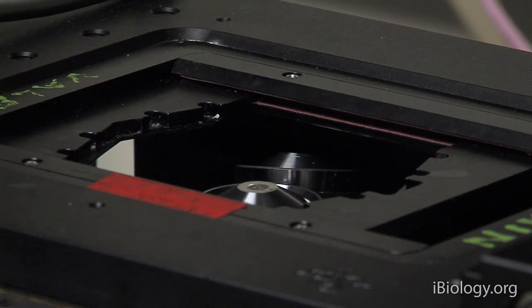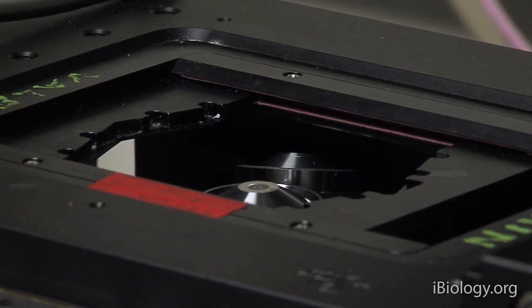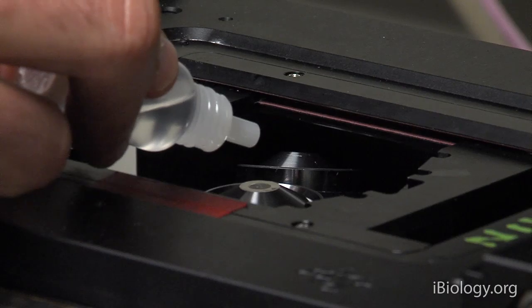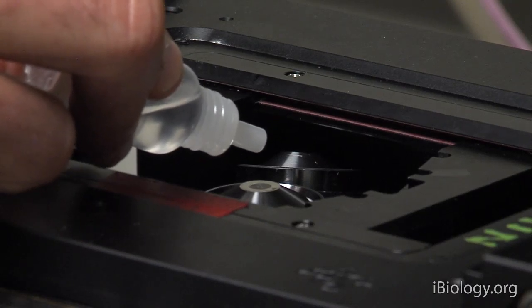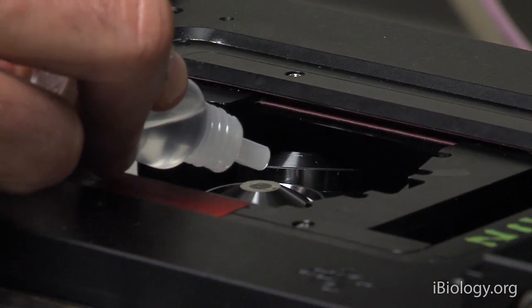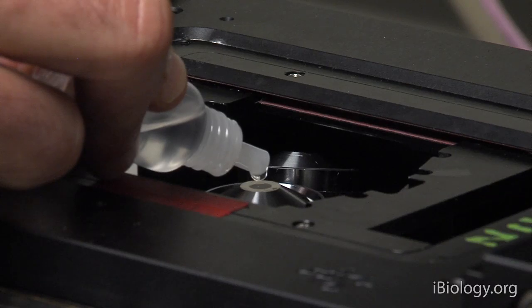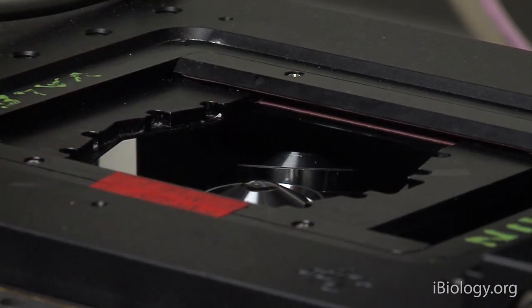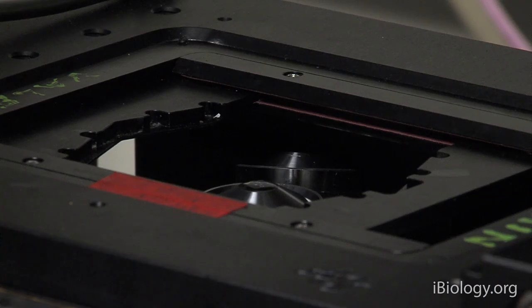So I have to place a drop of oil between the objective lens and the coverslip. One drop of oil should be enough. And I'm being careful not to touch the objective lens directly. There we go, we have our oil droplet.